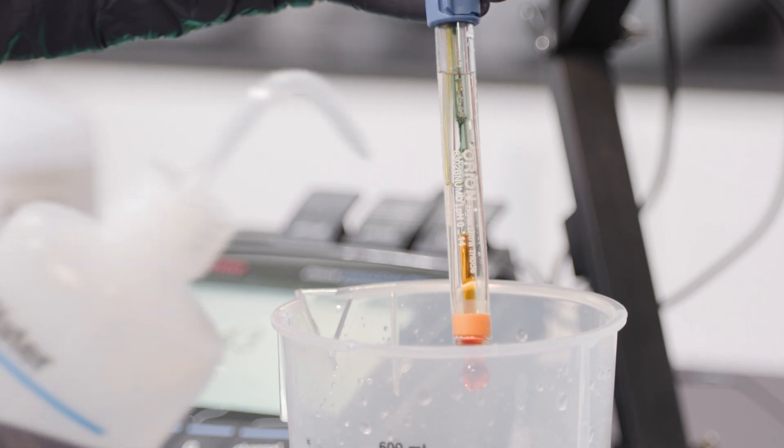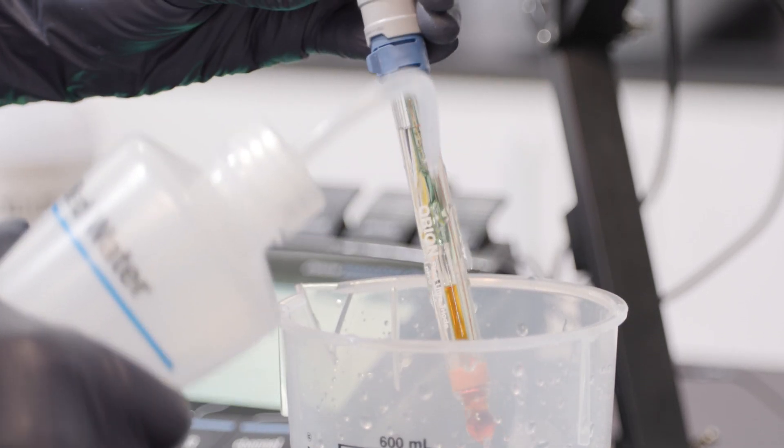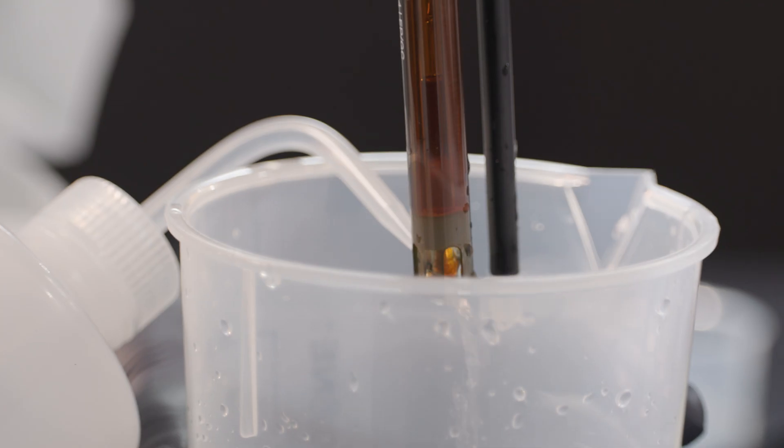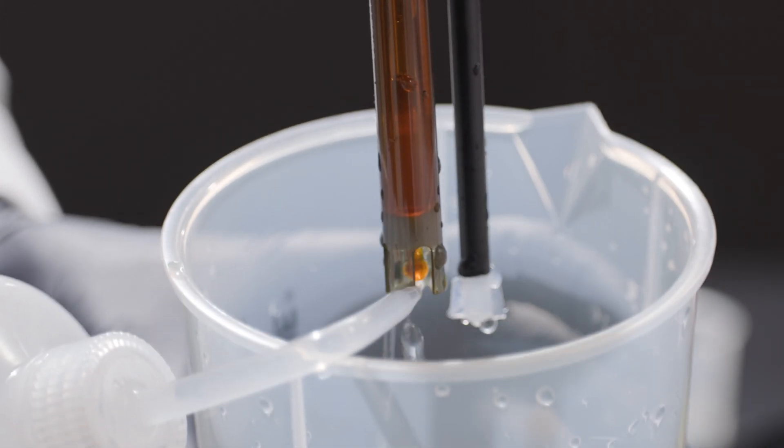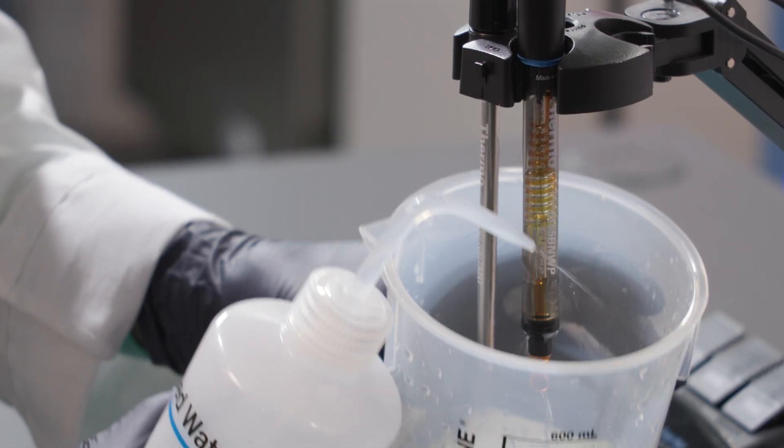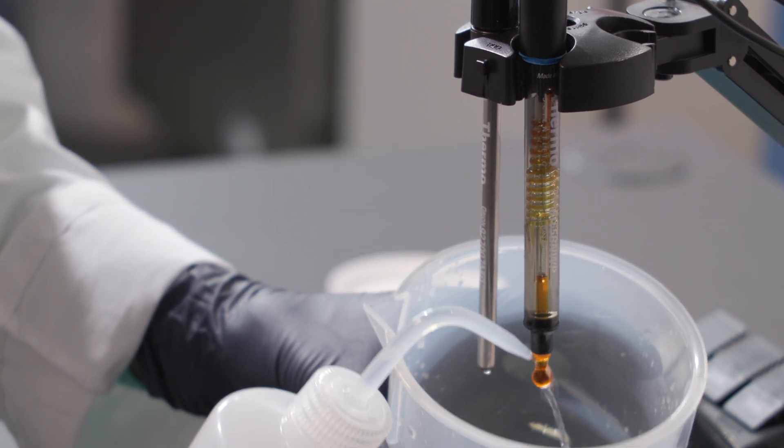For example, a pH sensor bulb on a glass electrode is easy to reach, but the bulb on many epoxy electrodes is protected by prongs and can be harder to access. Renewable or flushable reference junctions, as shown here, are easy to maintain and clean.